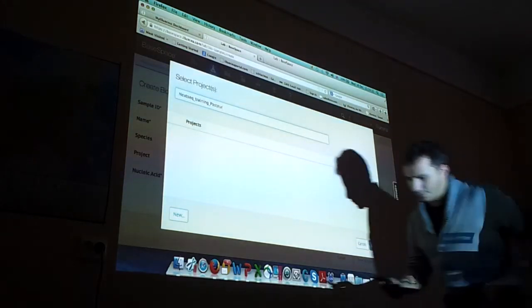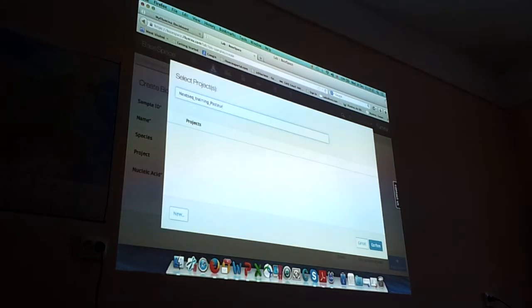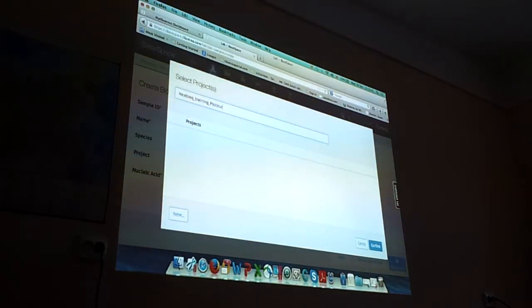Actually, one thing. Hi. Okay, we can try this actually. So it would be later. Of course, it would be good if you use your account. But maybe I can transfer this. I haven't tried it myself, so I will try this. Anyway, I create now the project.